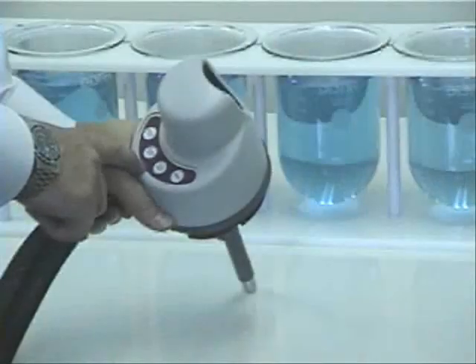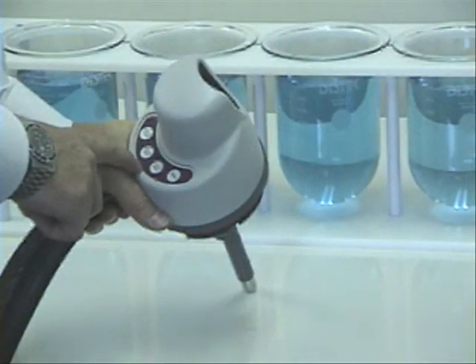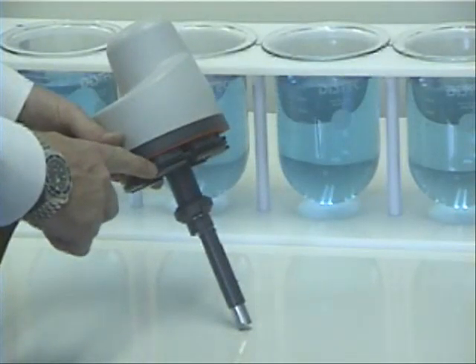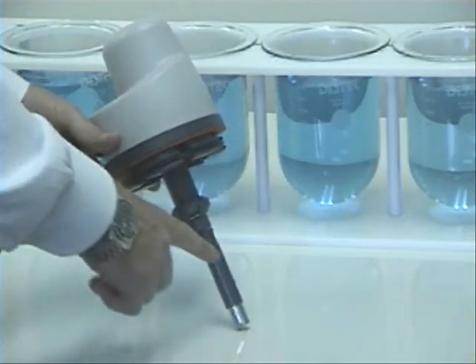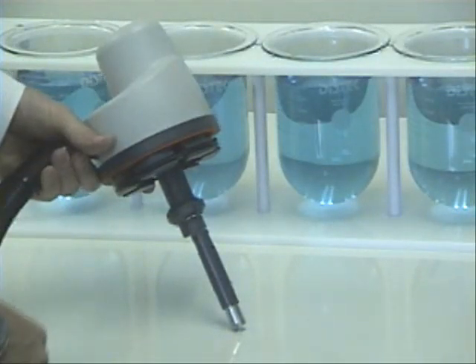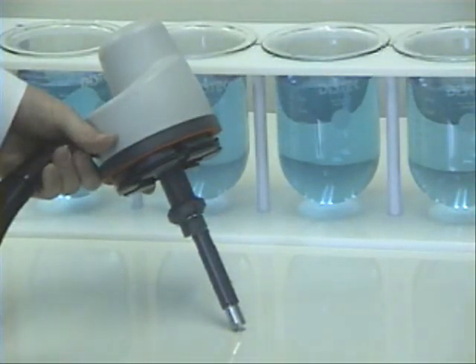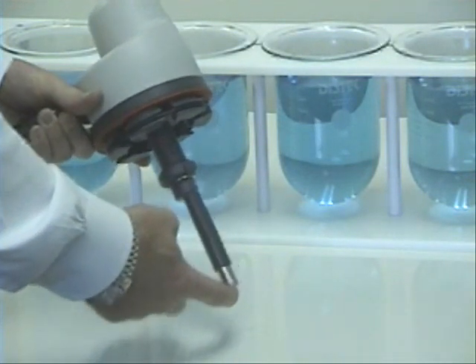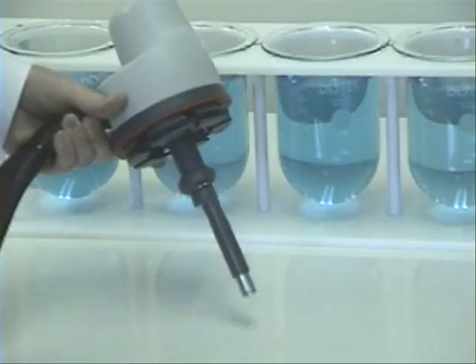The universal wash nozzle allows the chemist to remotely initiate a wash cycle while the self-adjusting O-ring permits hands-free operation. By integrating the drain and the cyclone wash nozzle into one assembly, the VIP4400 offers a full 360 degree wash. And the spring-loaded drain tip will automatically adjust to vessel height variations.